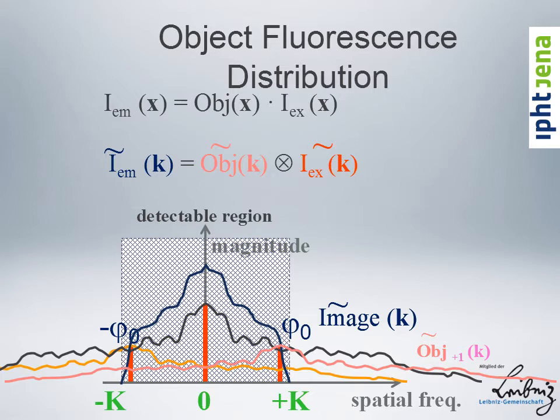And as I said, you can take not only one image, but several images, for example, 3 images where you phase shift phi 0 in a particular way. And the nice thing is that phi 0 phase shifts, for example, by rotating the complex plane in the plus direction, whereas this one rotates in the minus direction, and this one doesn't rotate at all. So we have 3 independent ways of influencing these, what I call object components. These pink and yellowish, or orange and pink and gray components are all called object components. They're shifted object components, and they are all influenced independently.